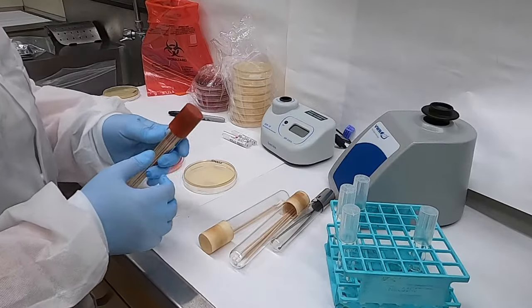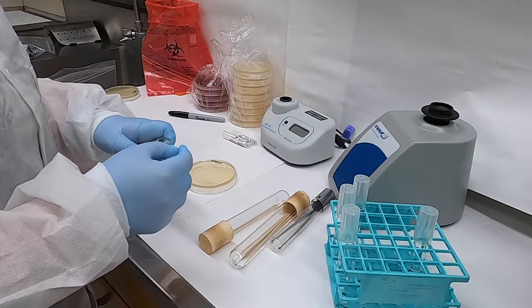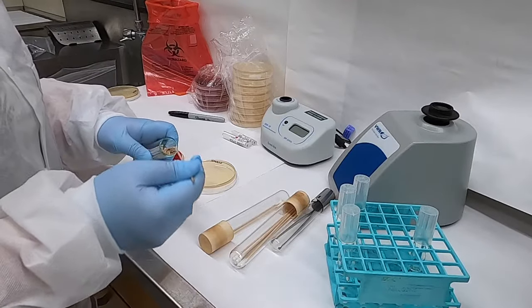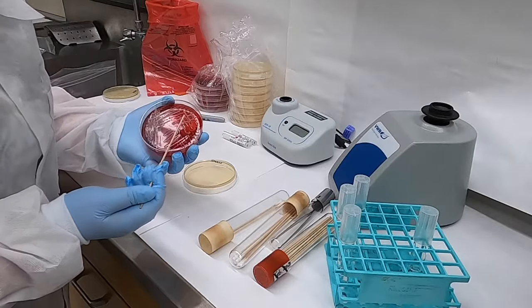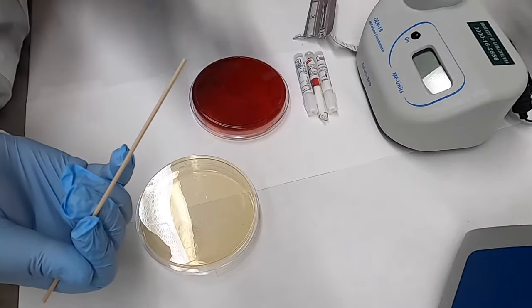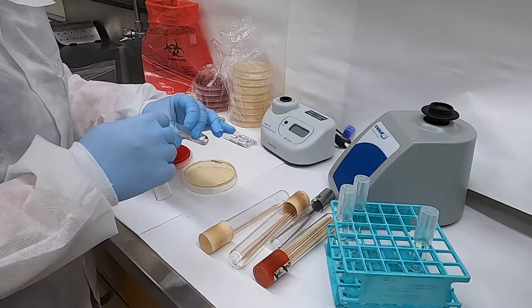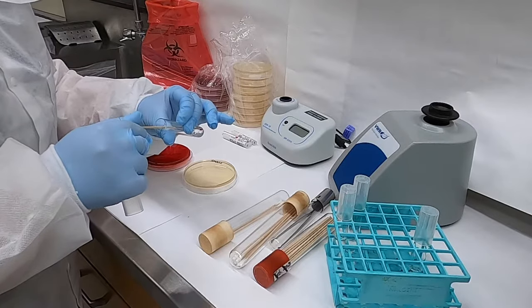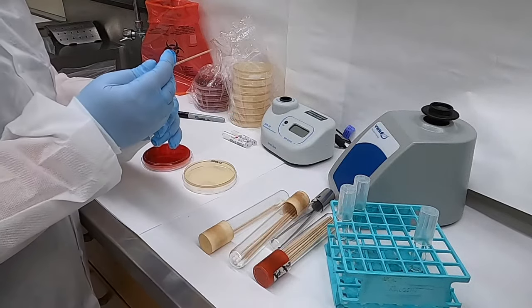The first step in performing a Kirby-Bauer disk diffusion test is to make a suspension of bacteria in liquid. So we start by taking a sterile stick or swab and picking several isolated colonies from our fresh overnight culture. Those colonies are then suspended in sterile water. You can see here we just rotate the stick along the side of the tube to try and get all of those bacteria off.